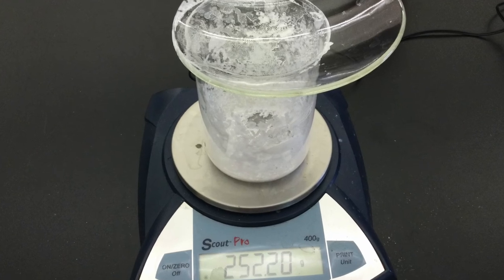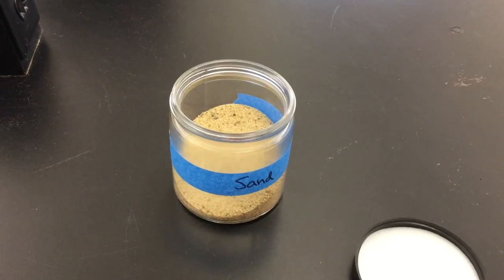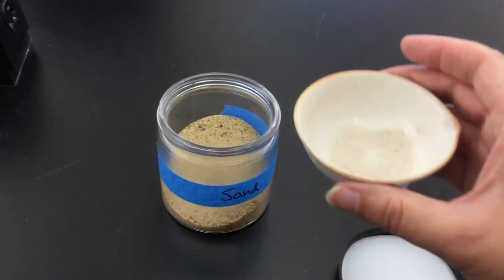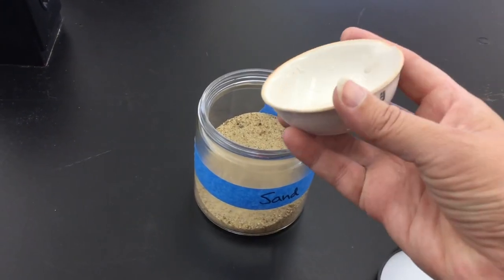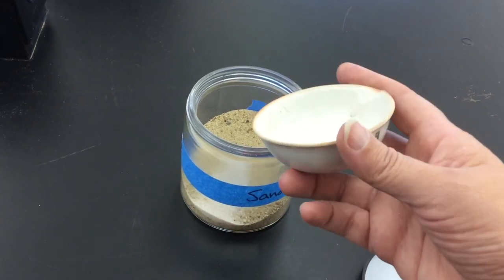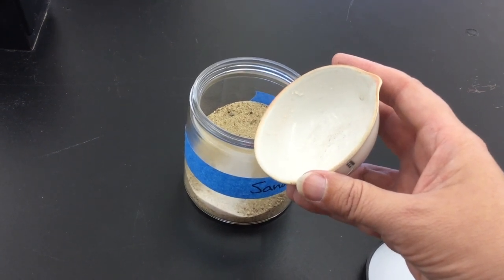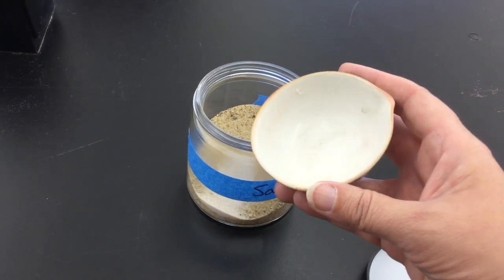Weigh the dry watch glass and beaker together on the balance. Because all of our separation processes are physical changes, we haven't changed the composition of the sand, so we can reuse it. Take the dry sand from your evaporating dish and return it to the labeled container that your instructor shows you. There will probably be some residue in the dish — clean this out as well so that the next lab has a clean, dry evaporating dish to use. Place your evaporating dish back in your basket along with the film canister.